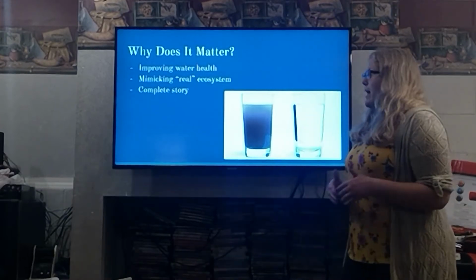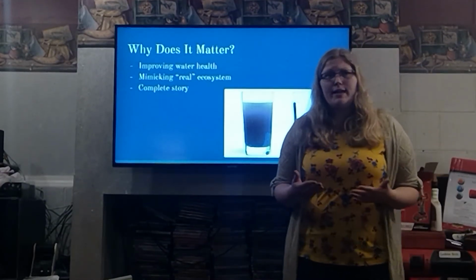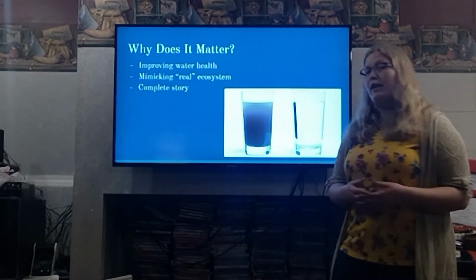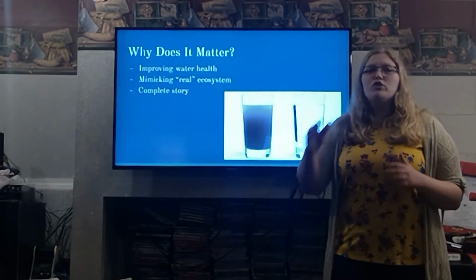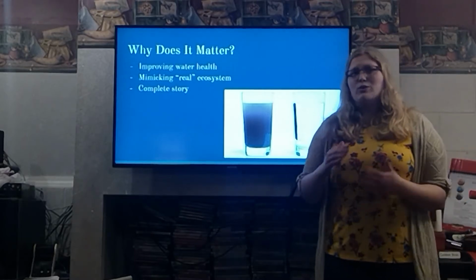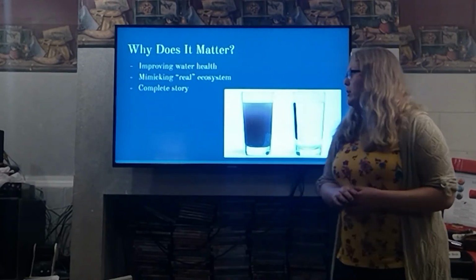So why does this matter? This matters because the end goal of this project has always been to improve public waterway health, because this is a more natural way of cleaning up water, like I said before. It doesn't use chemicals, it uses natural bacteriophage counterparts. We also did the water experiment because it mimics a real ecosystem. Instead of just having broth inside of a tiny little tube, we're actually using almost a liter of water, and the water is natural, straight from the creek, so we can see if we're actually shaping that wild population of phage.